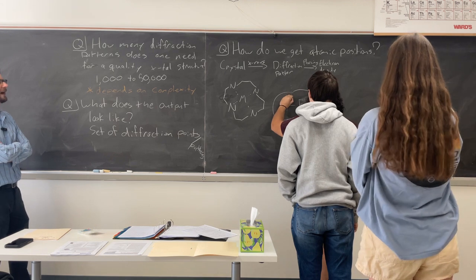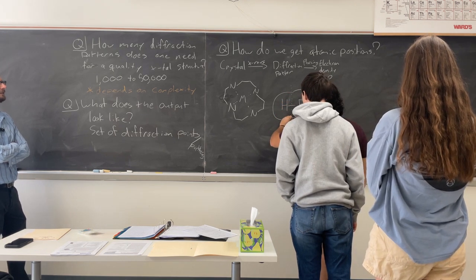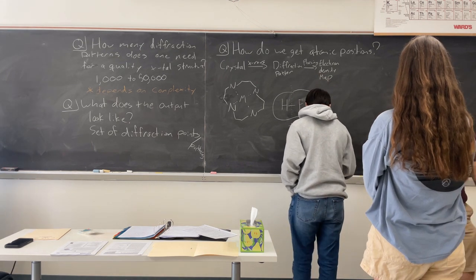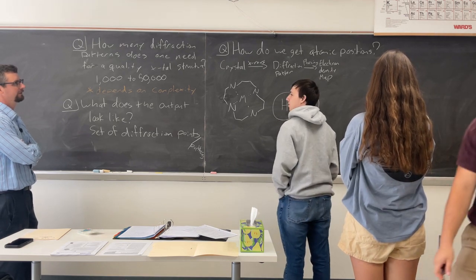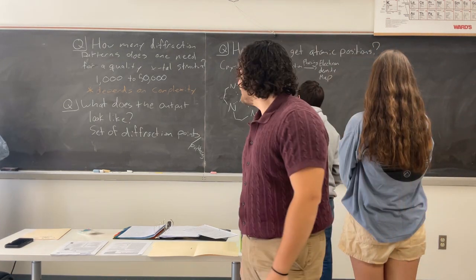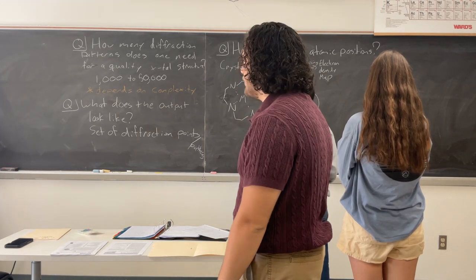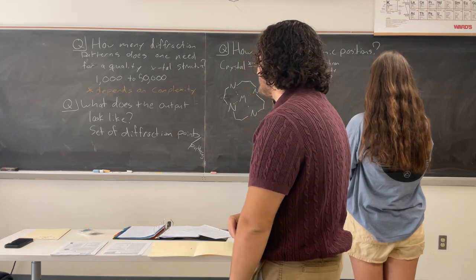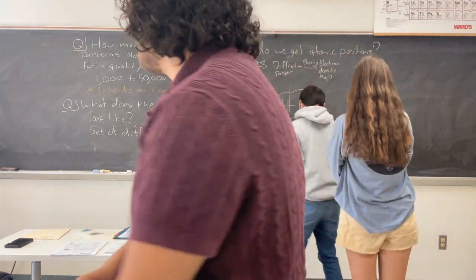Well, you're going fancy with dots. Okay. There's Aiden's. Joe, where's yours? Where does the hydrogen begin? Where does the hydrogen end and the fluorine begin, or vice versa, whichever way you want to go about it. We'll talk about that because this is electron density only. They do have nodes, but that's not what we're talking about.